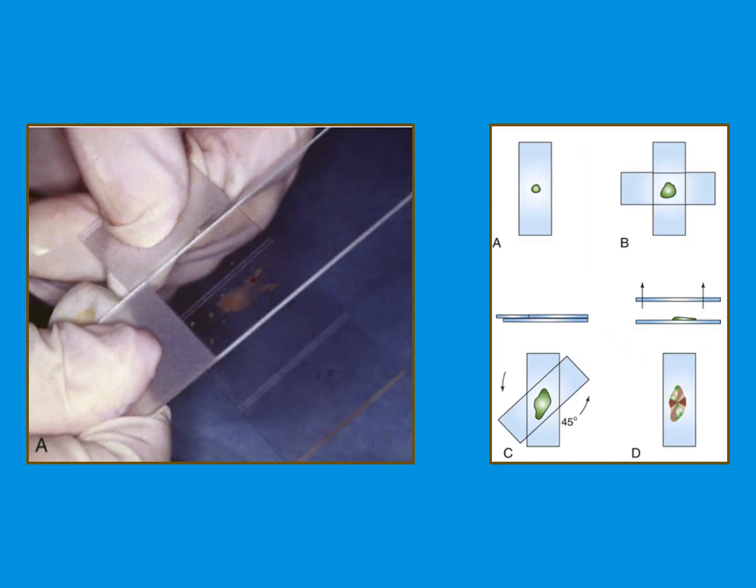So for our compression smears, or squash preps, what we're going to do is expel that sample onto the slide first. And this has to be done in a specific way.